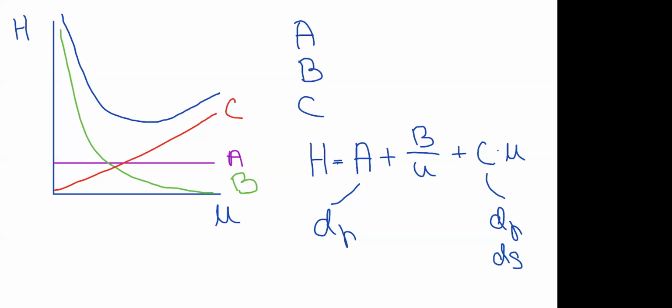And we also know that the mobile phase diffusion coefficient is important, but it has a reverse effect on the longitudinal diffusion and on the resistance to mass transfer. Resistance to mass transfer also is affected by the diffusion coefficient in the stationary phase. So these are the key factors that are important in getting a very good chromatography.